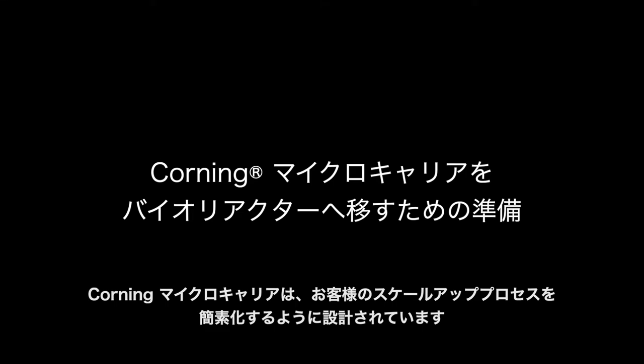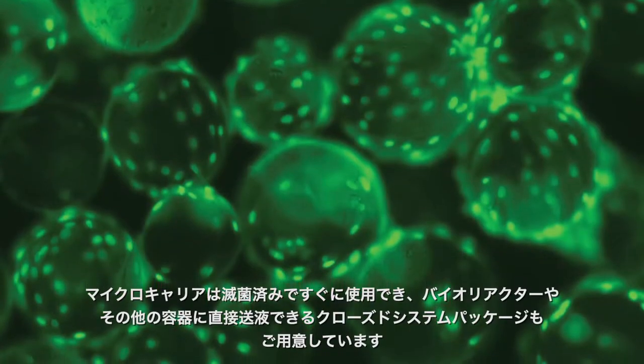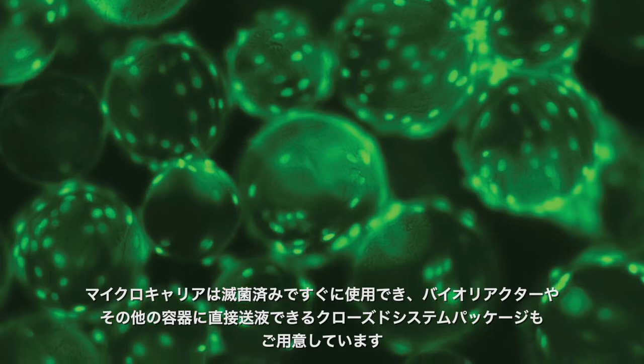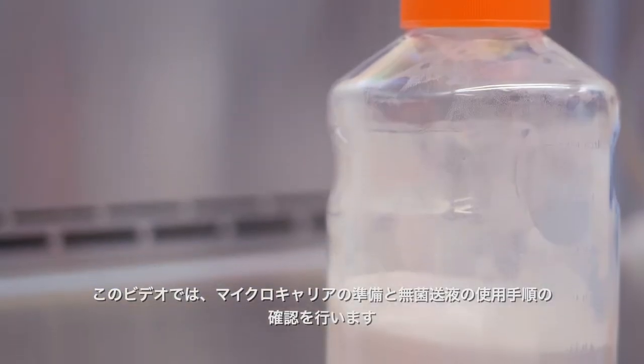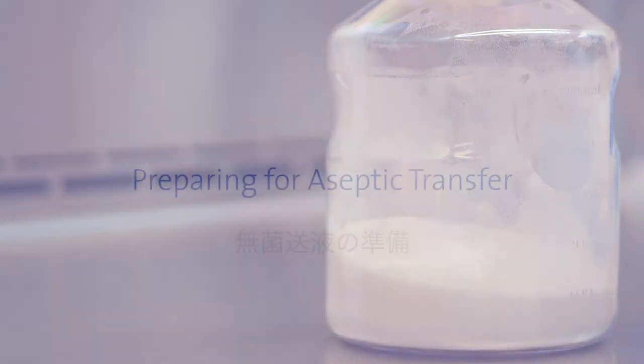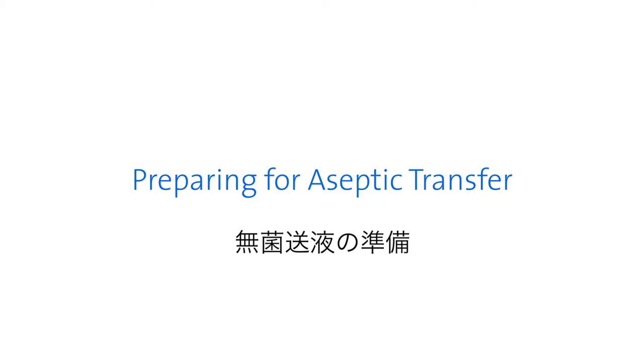Corning microcarriers are designed to simplify your scale-up processes. The microcarriers are sterile, ready to use, and available in closed systems packaging that can be used directly with bioreactors or other vessels. In this video, we'll review the steps for preparing and aseptically transferring the beads.